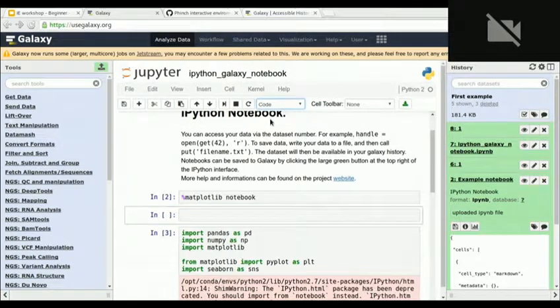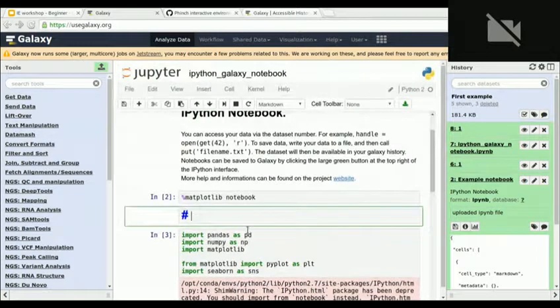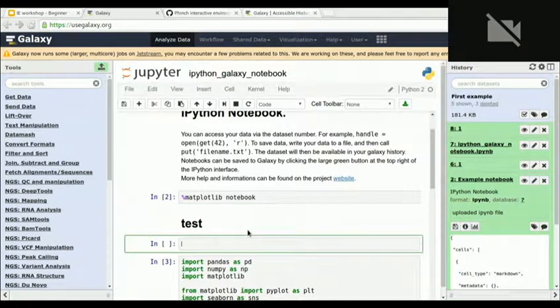Here, this box where you can change code or markdown. So the problem is that you get some simple annotations that you're adding, where you can write. Then you should execute the cell, and during execution, it's rendered to simple markdown.